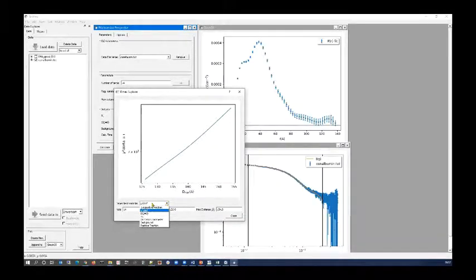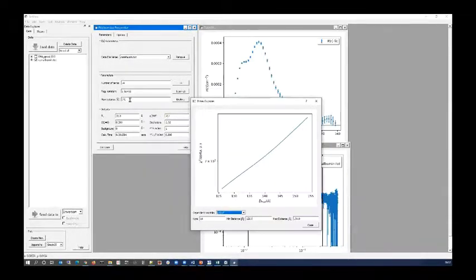The one that we have selected at the moment is the chi-square. The maximum distance we have set is 140, which is out here, but actually a smaller maximum distance looks like it would be better. What we can do in this little widget is actually see how much lower or larger, if that were the case, we have to go.